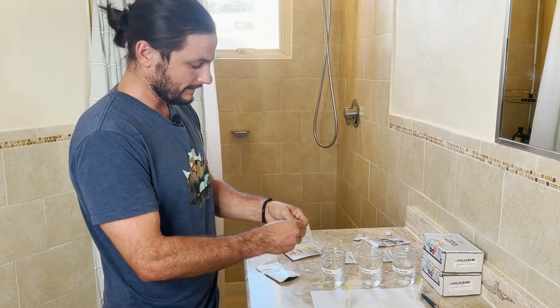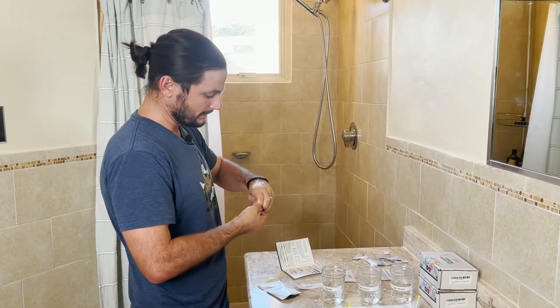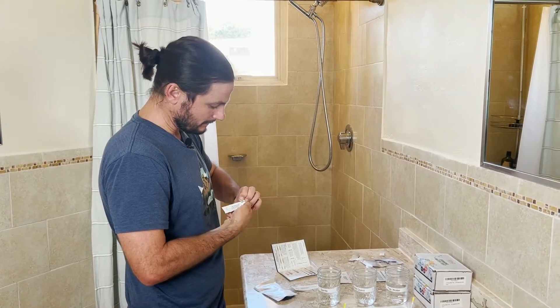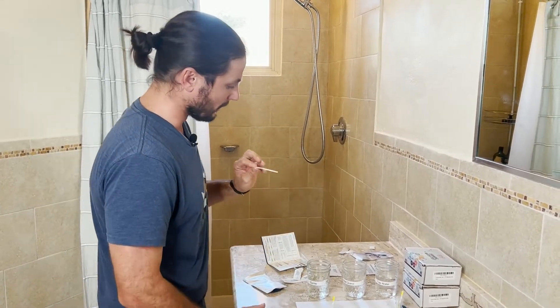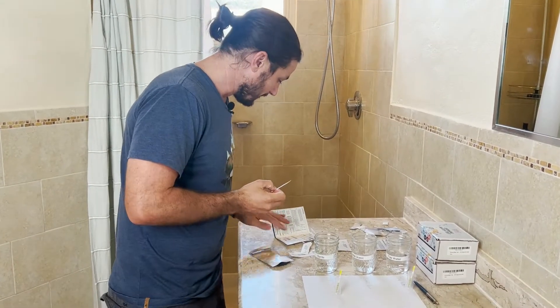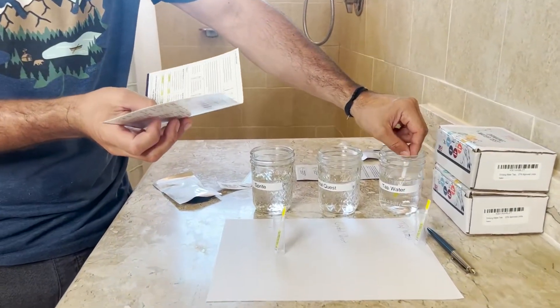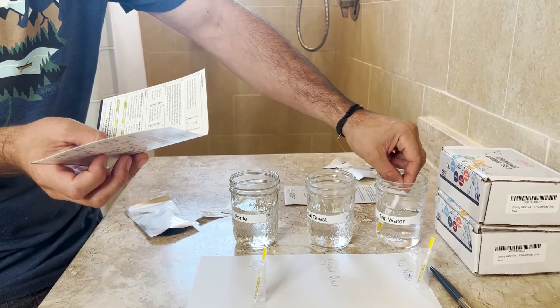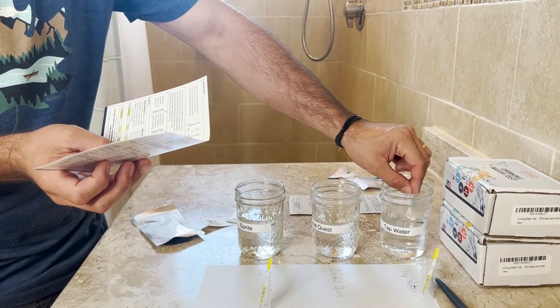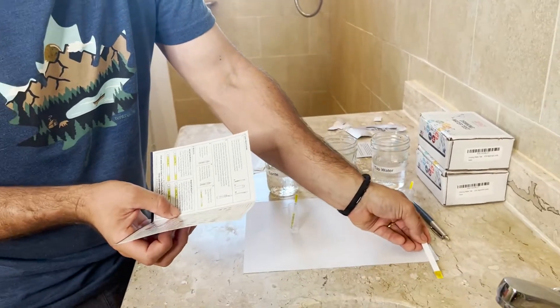We're going to do three chlorine tests. So just go ahead and tear this open. Chlorine is the number one thing people really want to remove from their shower water — you're not drinking this water hopefully — and that's what can dry out your skin and hair. So this is really important. We'll see how effective the filters are. Just dip this into the water, starting with the tap water, for about five seconds back and forth. And then put that right there.